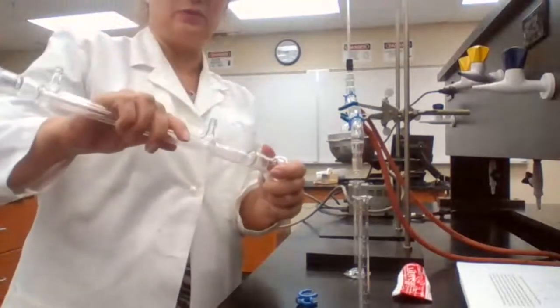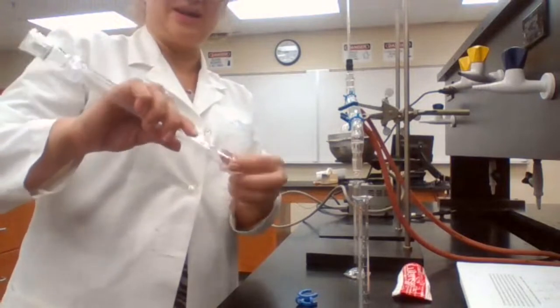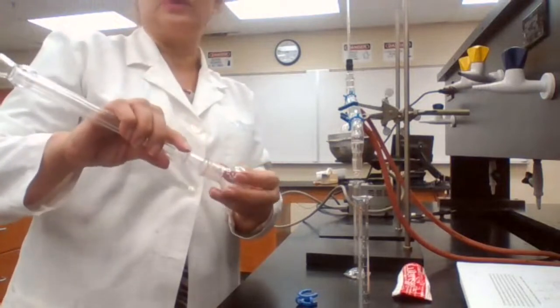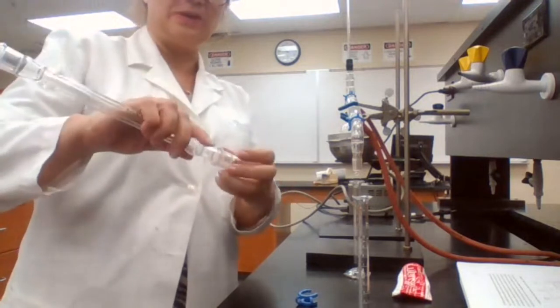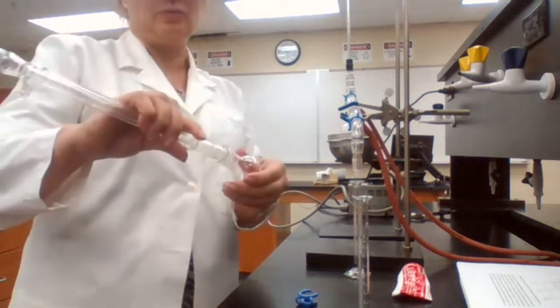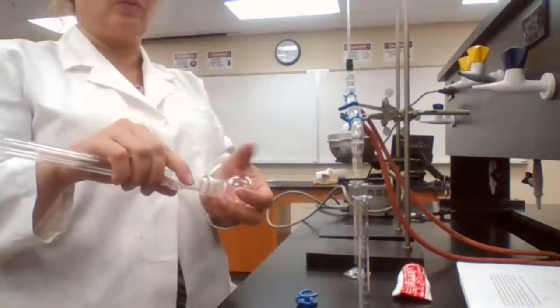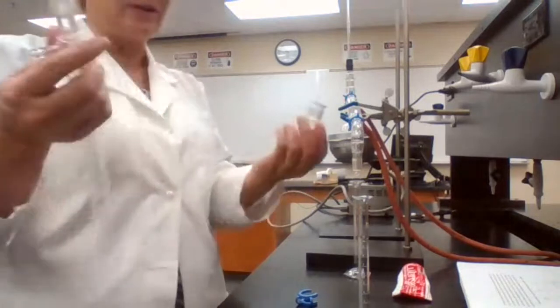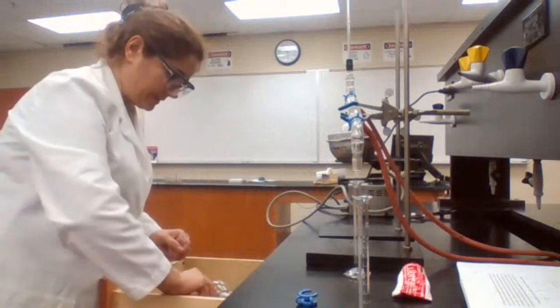It would be hard to remove after you stop heating. They get stuck together and you won't be able to separate them. But when you grease it, it's easy to remove, and it separates well. Sometimes you have to break one piece in order to get the other one, or you can't separate them. So that is the other piece.